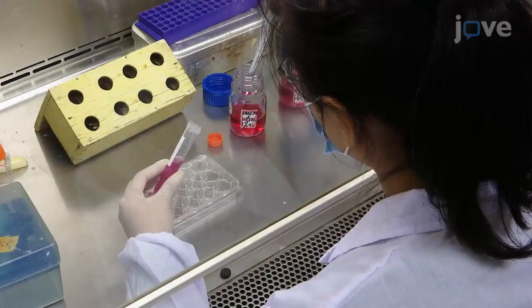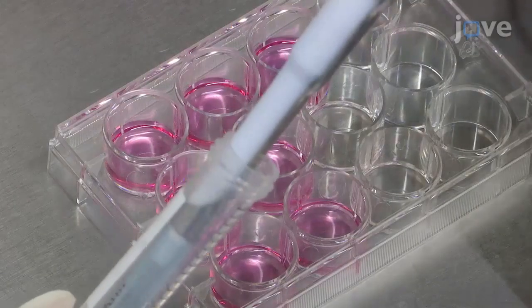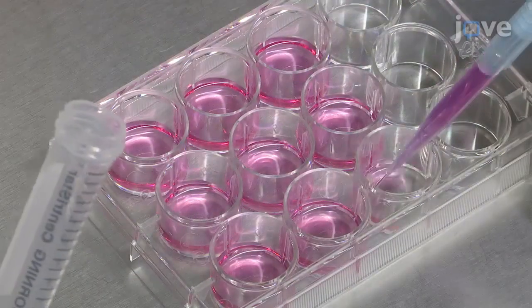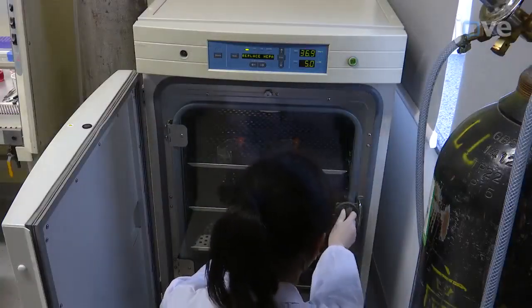After counting, dilute the cells to a 2 x 10⁴ cells per milliliter concentration. Seed 1 milliliter of stem cells onto 1 poly-D-lysine coated coverslip per well in 9 wells of a 12-well cell culture plate. Check the cell density under a microscope and return the cells to the incubator for 12 hours.